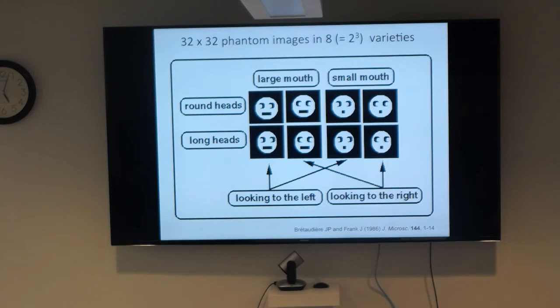I was wondering why projection matching is done in Fourier space instead of real space, and I guess you hit the nail on the head, the convolution and the cross correlation are much easier to compute in Fourier space. That's the primary reason.